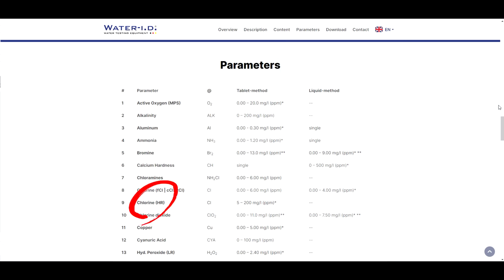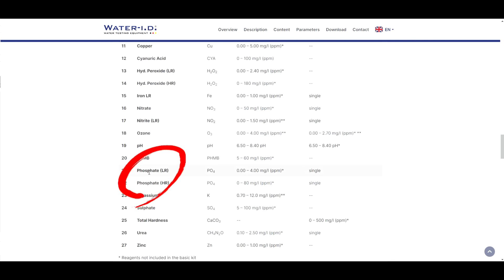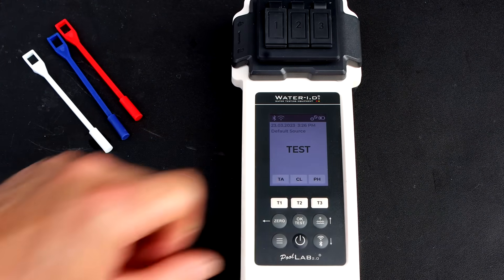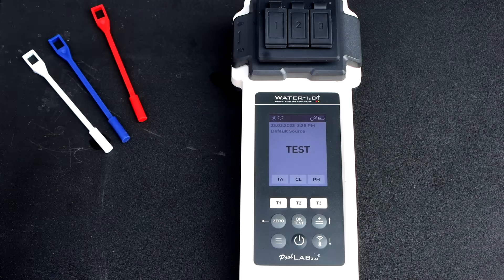You have high chlorine, which will test chlorine up to 200 parts per million. You also have copper, iron, and nitrates — which is becoming more and more of a problem in the United States. You can also test ozone if you have an ozone system, and there are phosphates low range and phosphates high range. Although these clips have been trimmed for the sake of time, I had a clock running during testing, so you'll see the real time displayed in the top right.